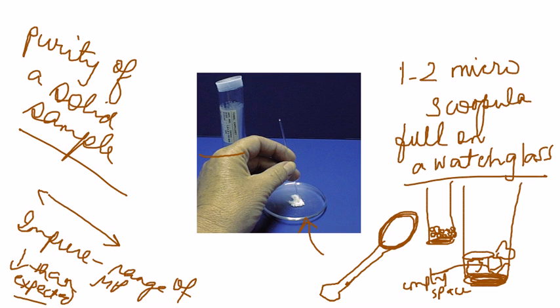You're using up the majority of the volume of the space, so the excess has been minimized. For that reason, there is a minimal amount of air, and your reading is going to be a lot more uniform.